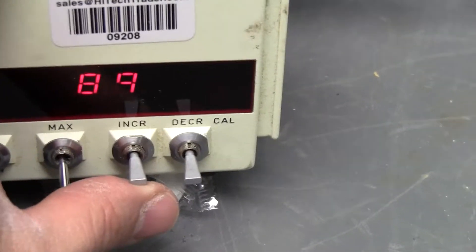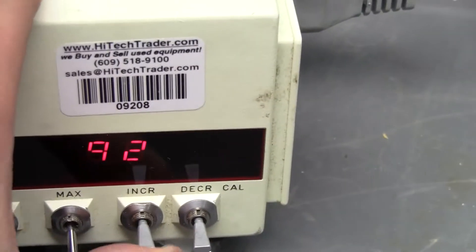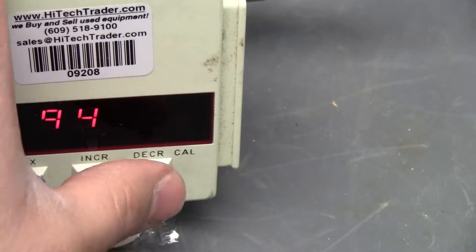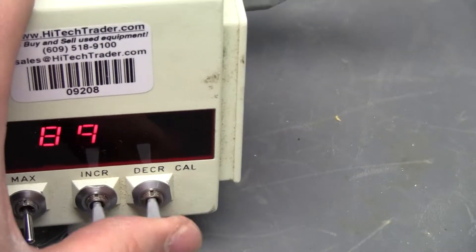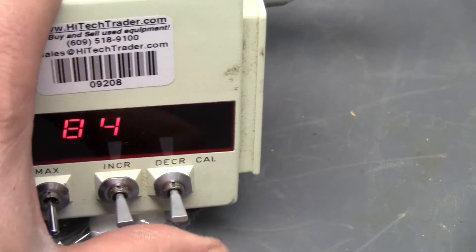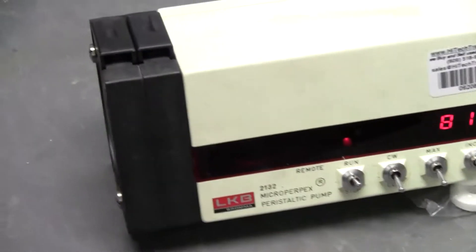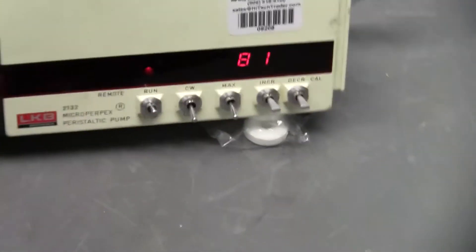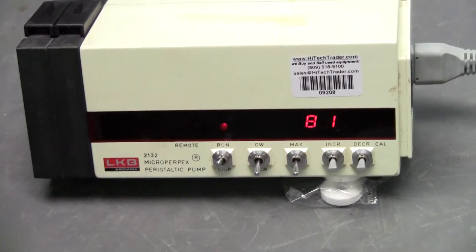Then to increase or decrease your RPMs manually, you would just hit up. Or to decrease, you would just up and hold. Up and hold. Yeah, like this. If you have any further questions, please don't hesitate to call 609-518-9100. Thank you from Hitech Trader.